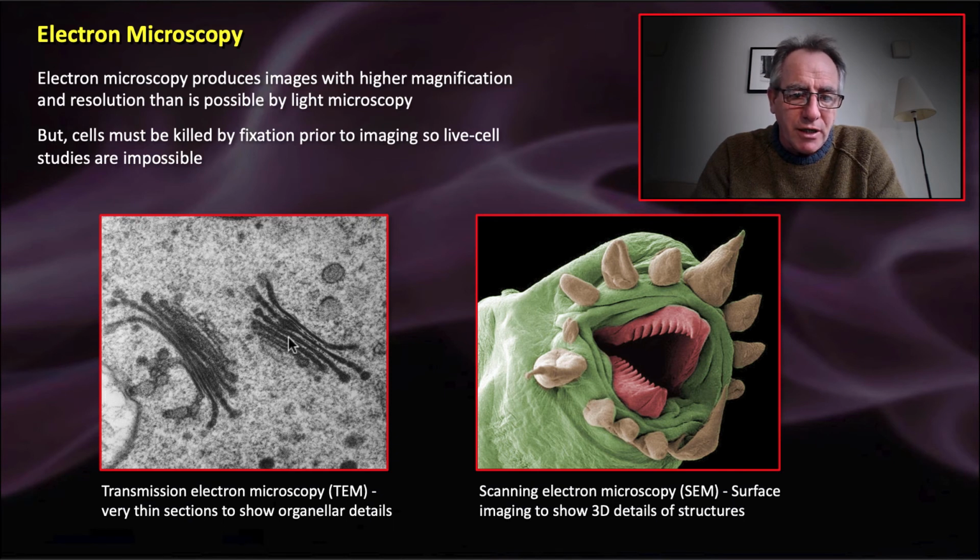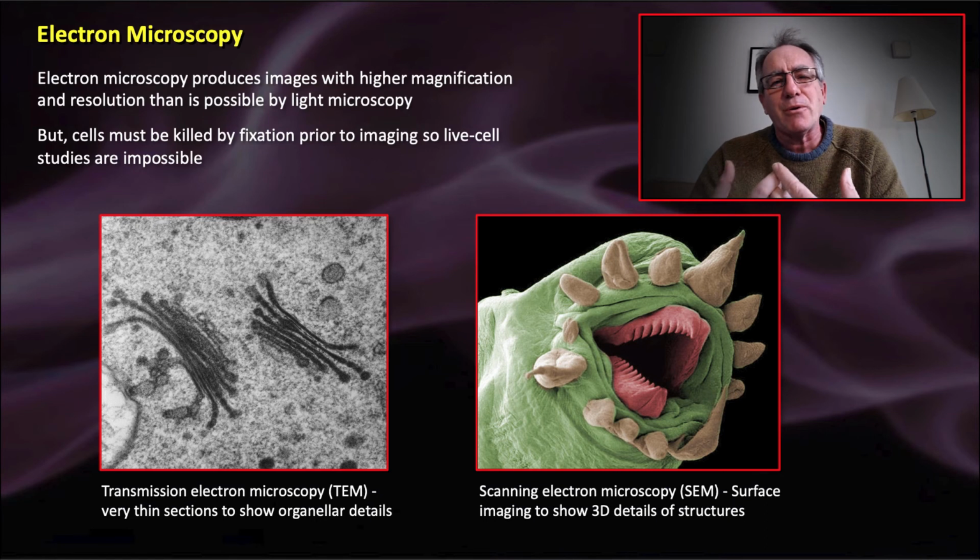Look at the beautiful detail of the membranes, the membrane stacks that we call cisternae, the little vesicles that bud off from the Golgi bodies and deliver proteins around in the cell to where they need to go. So almost our entire understanding of the structure of things at the organelle level down in cells is because of transmission electron microscopy over the years.